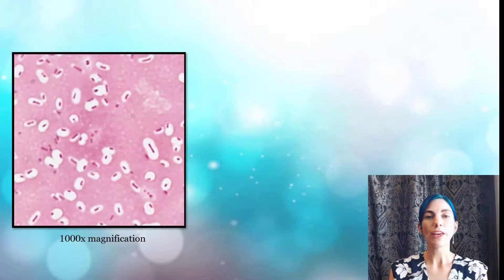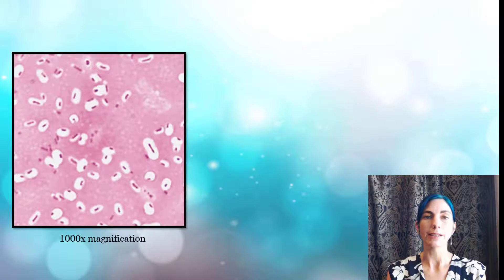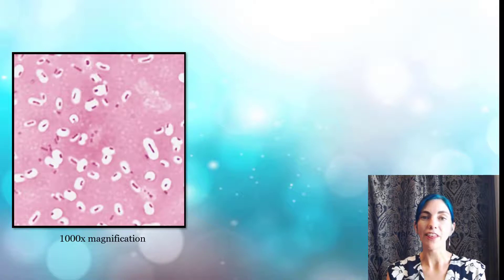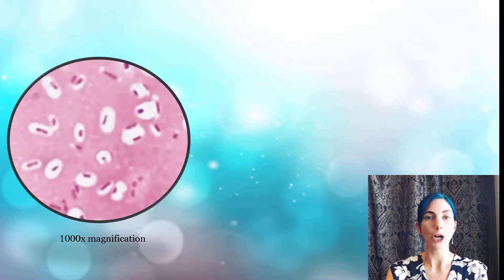So this image here shows a real picture of a successful capsule stain. Surprisingly they're actually rather difficult to do. Not every student does them successfully but this is a successful capsule stain viewed at a thousand times magnification. So what are we looking at here?